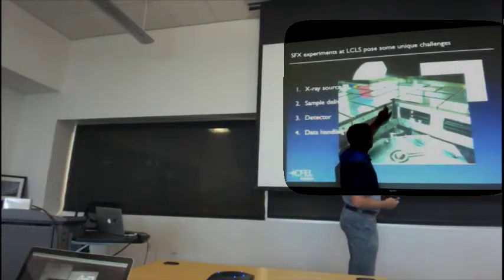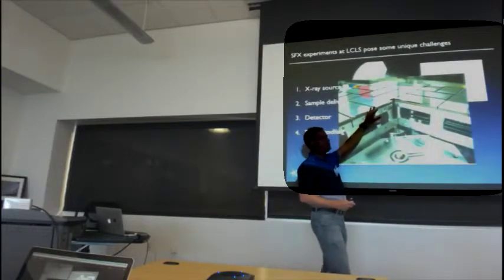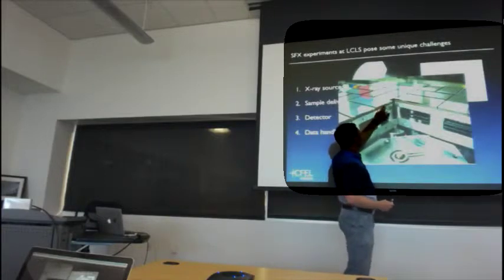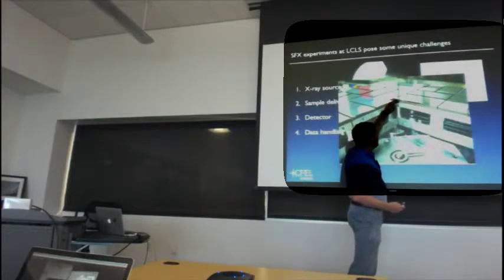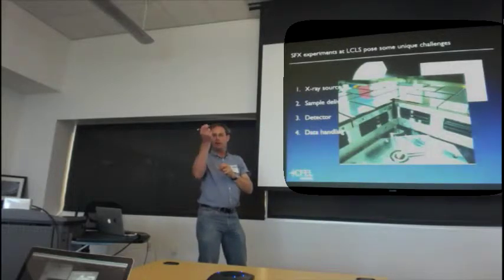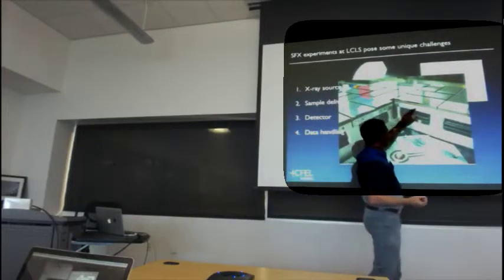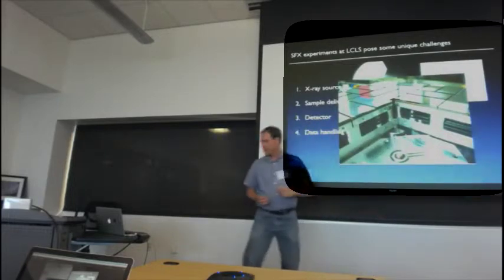So these consist of a silicon front sensor element. It's aluminized on the front to keep visible light out. Silicon front sensor element, and underneath, immediately below that, is a set of specific circuits. Behind each pixel is an amplifier circuit that amplifies the charge and digitizes and gives a readout in 120 frames a second and reads out all these things.